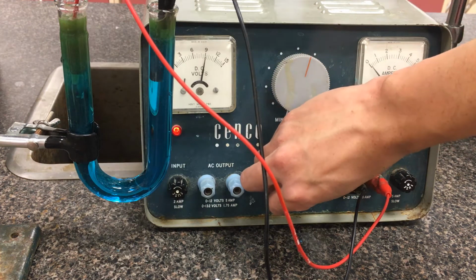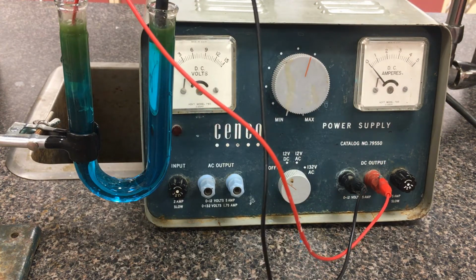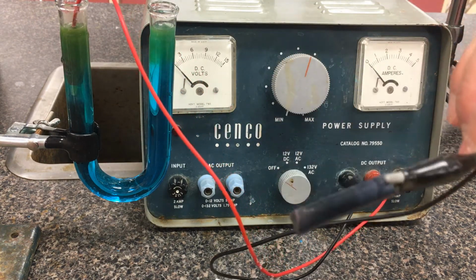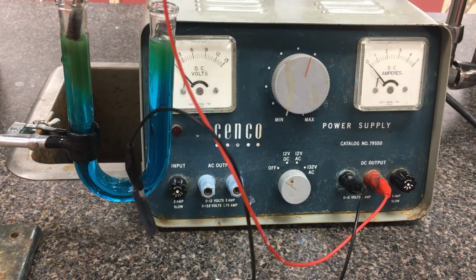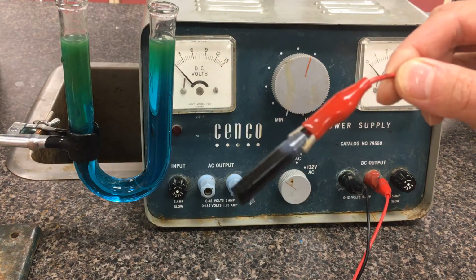So I'm just going to flip this off. And I'm just going to show you the electrode itself. Not only can we make observations of the inside solution. So here's the copper electrode. And on the other side, similarly, here's our graphite electrode.